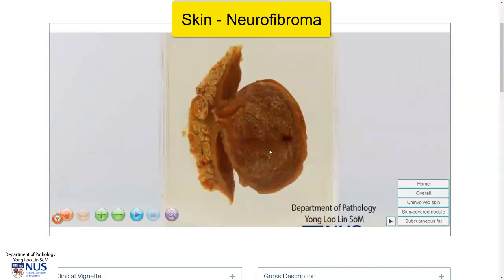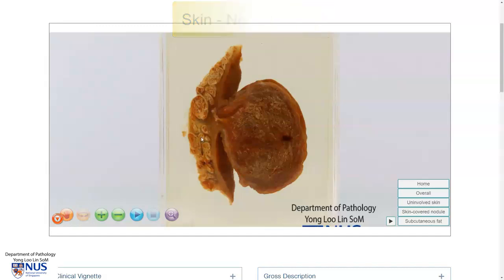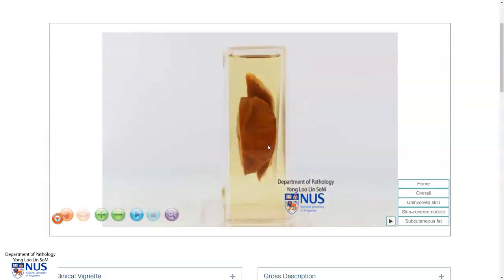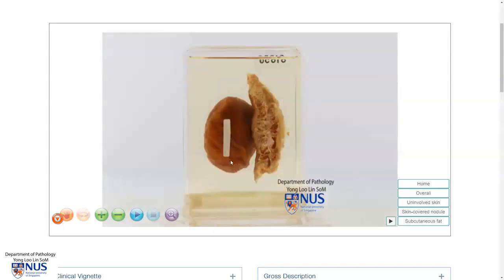On the cut surface, we can see that this has a sort of yellowish appearance, but it's slightly different from the underlying subcutaneous fat. As we turn this around, we can see the overlying skin, which is intact and not ulcerated.